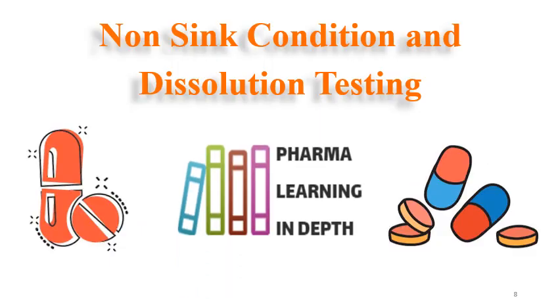Dissolution is a very vast topic, and if you learn, you will enjoy this topic, and that's why I make videos mainly on dissolution testing. It is the heart of formulation design, and also it is a link to in vivo formulation behavior prediction.